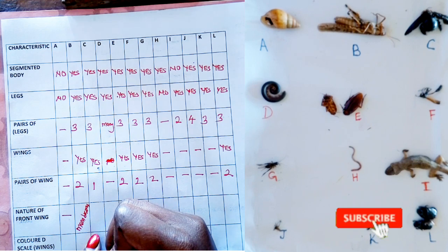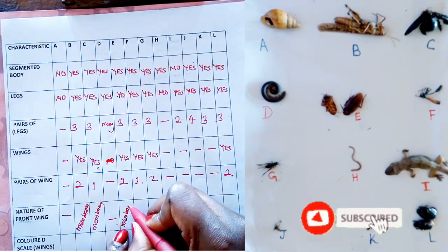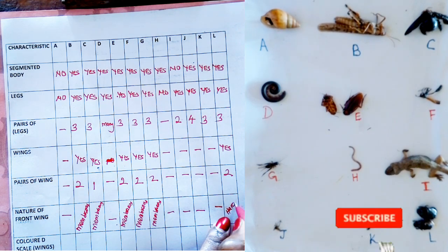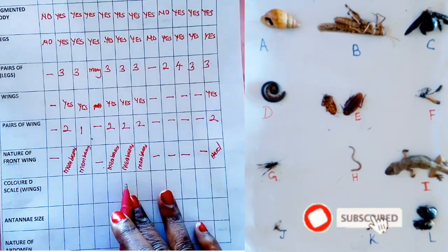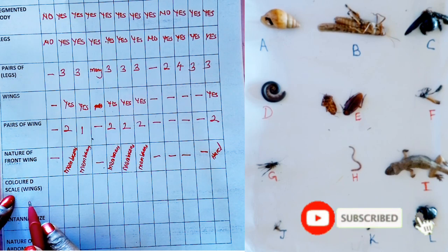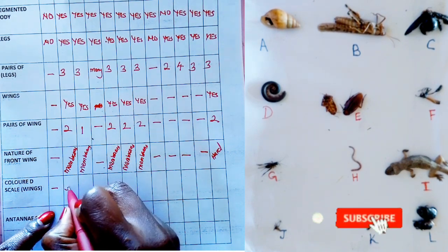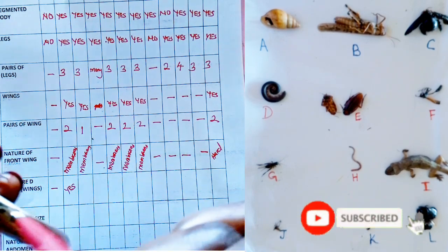C, membranous. L, hard. Colored scale. That is on the wings. Does B have colored scale? Yes. There are some beautiful colors on the wings.